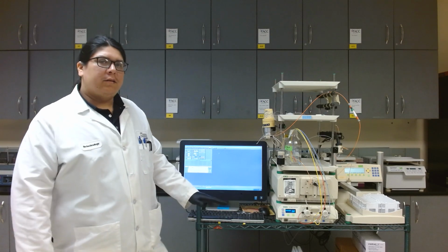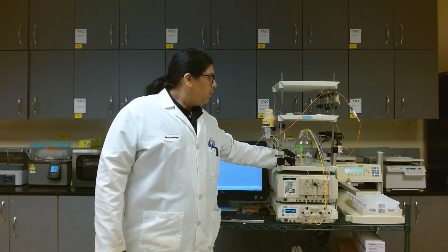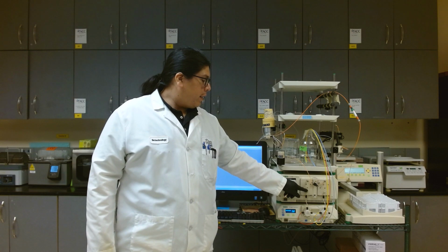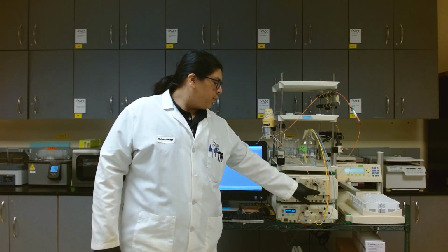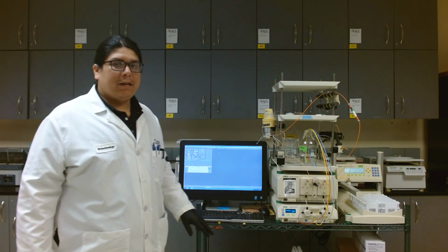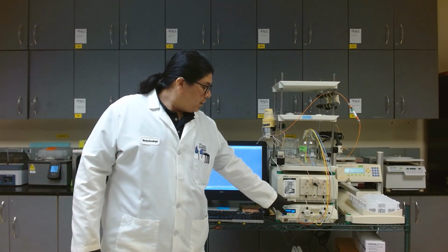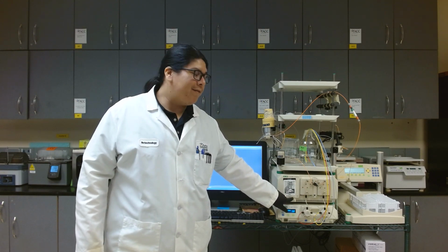Okay, now that our system has been primed, so we've basically drawn in our water, flushed the ethanol out of the inlet lines up to the maximizer and here at the pump. So now what we want to do is purge the pumps. So that's going to run them at maximum capacity for approximately 30 seconds. So in order to do that, it's very simple. We'll just push the buttons here that are labeled A and B. It also says purge right above them.